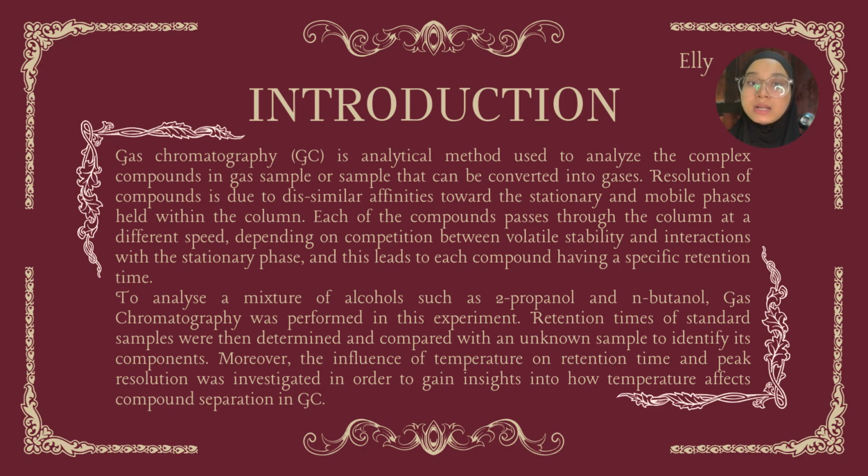To analyze a mixture of alcohols such as 2-propanol and N-butanol, gas chromatography was performed in this experiment. Retention times of standard samples were determined and compared with an unknown sample to identify its components. Moreover, the influence of temperature on retention time and peak resolution was investigated in order to gain insight into how temperature affects compound separation in GC.